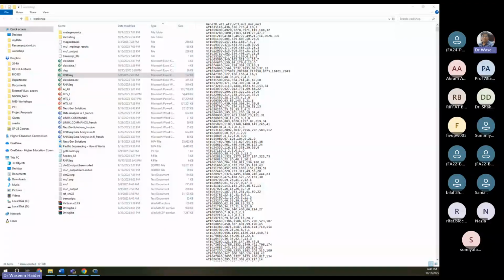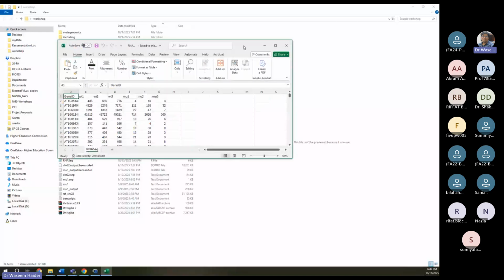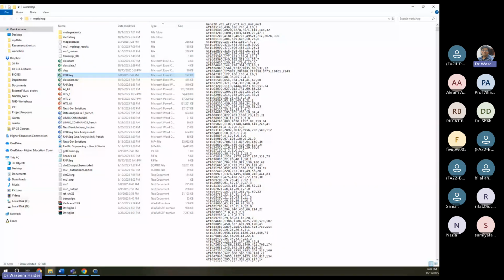So this is opening on my other screen. Let me bring it here. So it looks like this. You did not know what exactly CSV is, but if you just click here and here, it will show you that this file looks like this. So the actual structure of the file is where we have the separators as these commas, right?